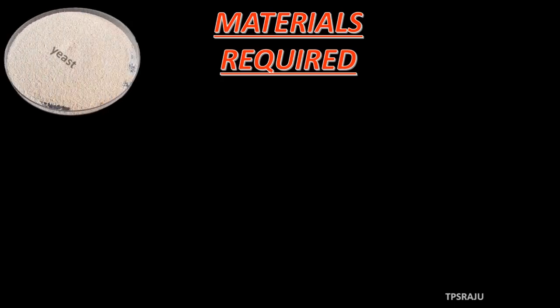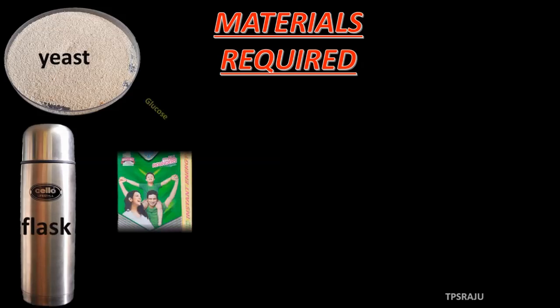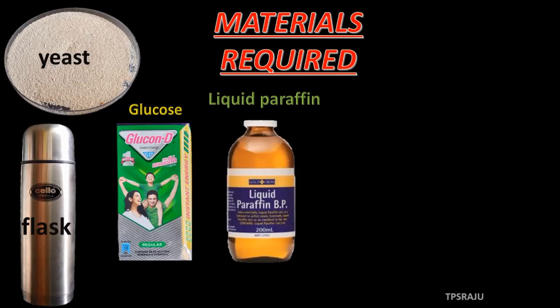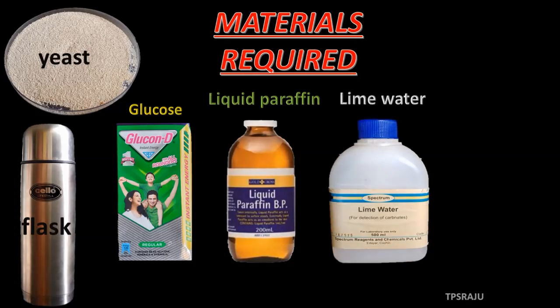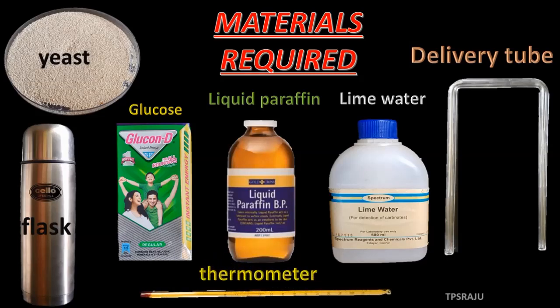Materials required. Yeast powder, flask, glucose powder, liquid paraffin, lime water, delivery tube, thermometer.